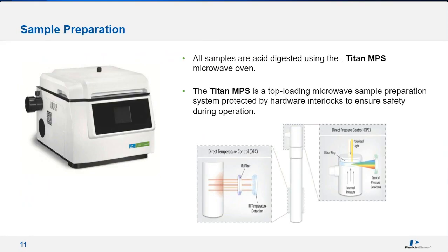So for all of our work that we've done so far, we used the Titan system. The vessels inside there are made of very high quality, high purity, very low porosity TFM, PTFE material, resulting in very low carryover from sample to sample or digest to digest. And I have some method blank data I prepared before. I can show you shortly.